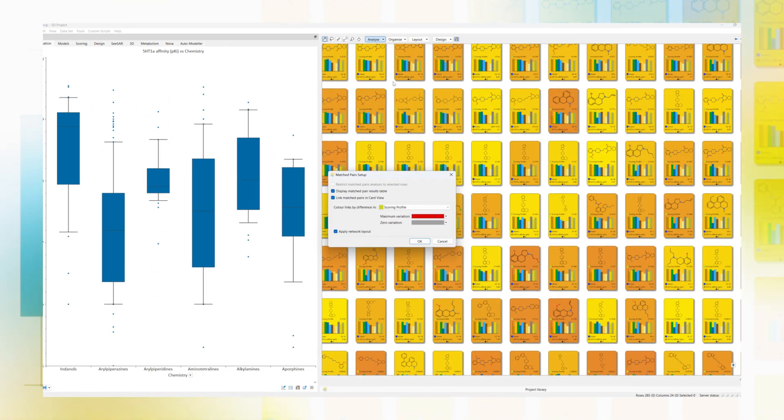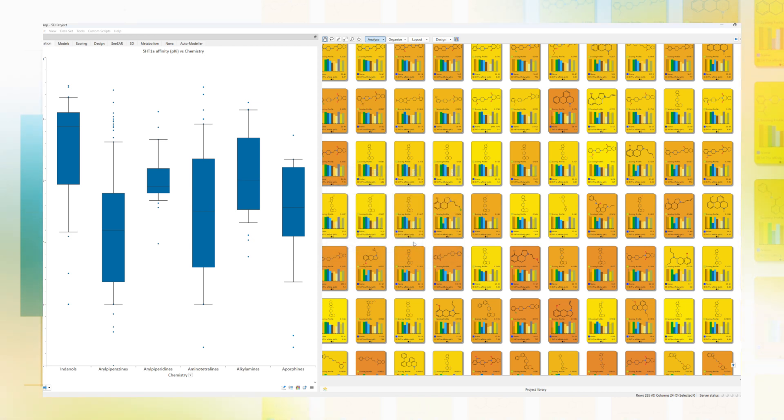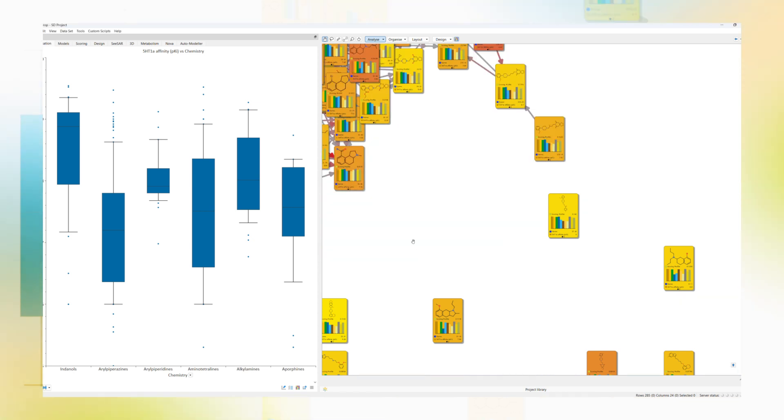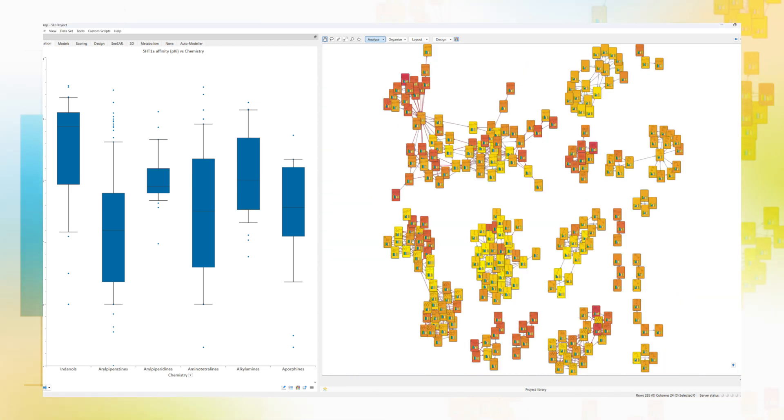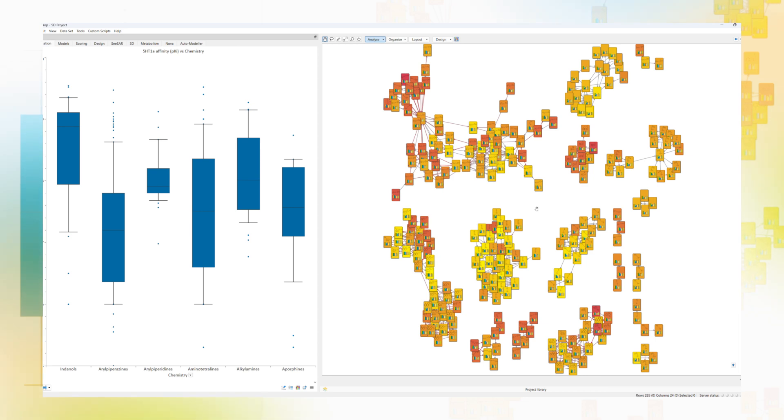Flexibly explore your data in card view to understand the structure-activity relationships in your chemical series, using techniques such as stacking and clustering, activity cliff detection and matched molecular pair analysis.